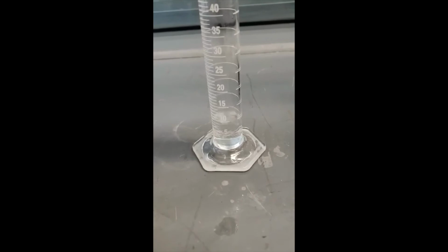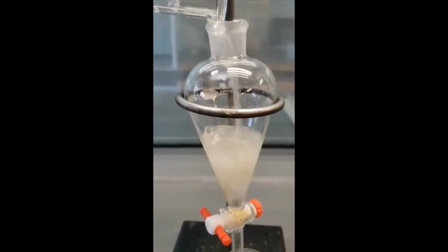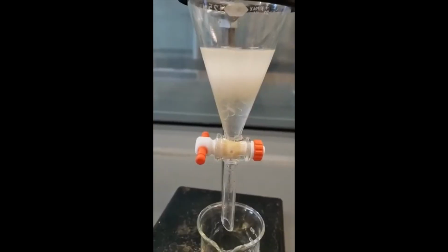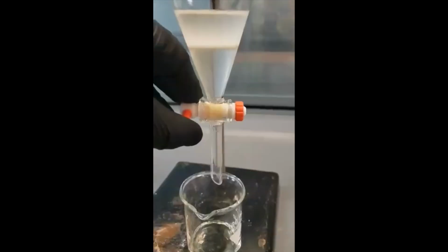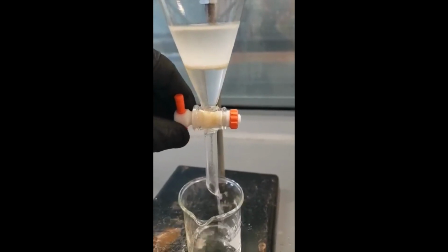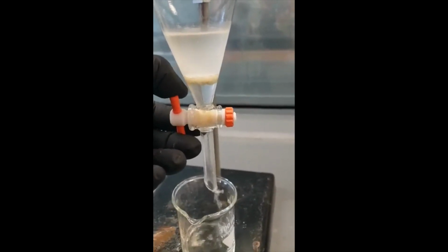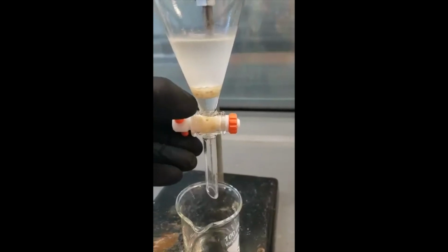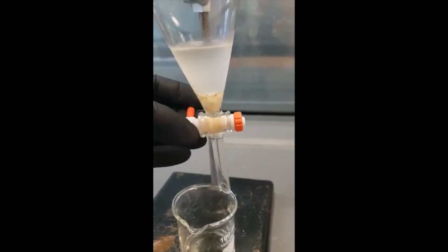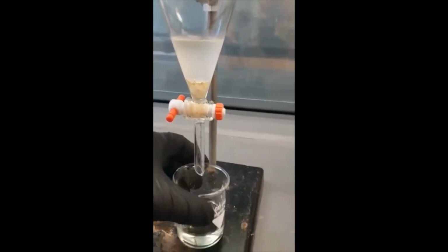Add 10 more milliliters of methylene chloride to your separatory funnel. Cover it, shake it, and vent it, and shake it and vent it. Let your layers separate again. Transfer the bottom layer into that original beaker, adding it to your first fraction, and do that 2 more times for a total of 3 extractions with methylene chloride. Once you have all 3 fractions, about 30 mL of the methylene chloride, set it aside.